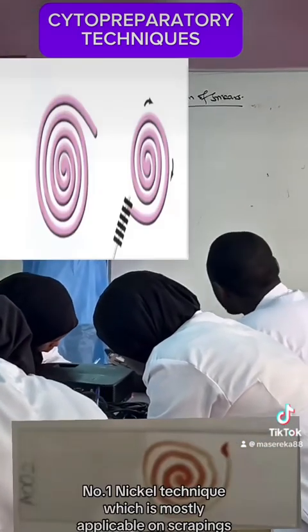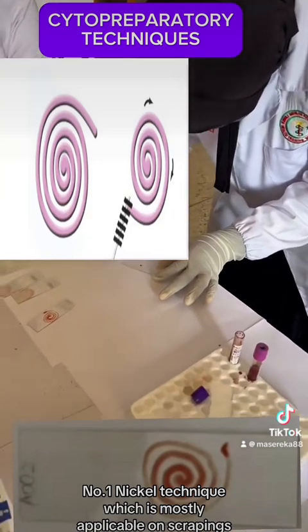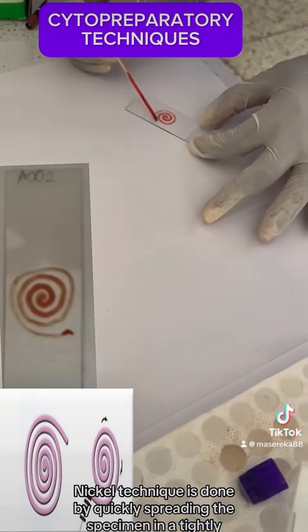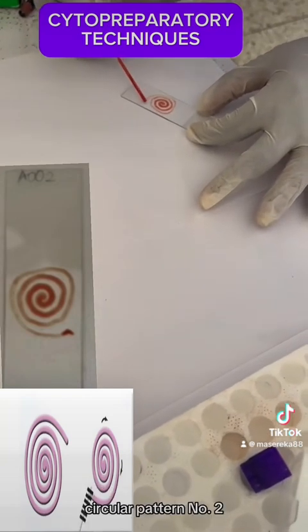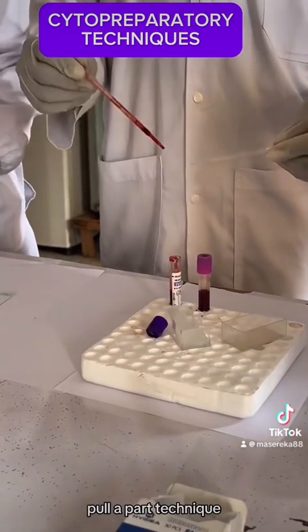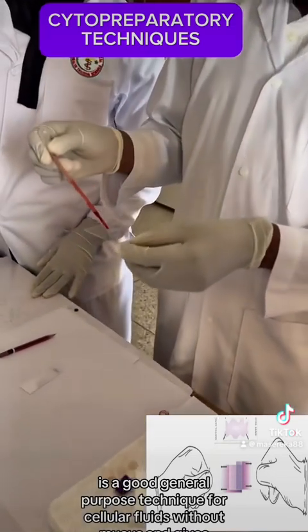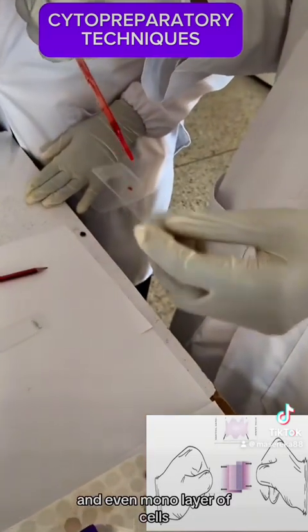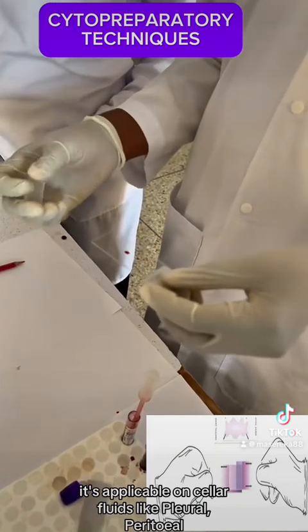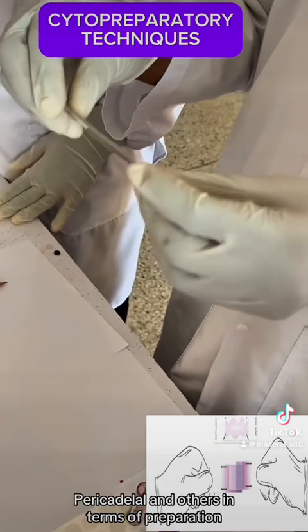Number one, nickel technique, which is mostly applicable on scrapings. The nickel technique is done by quickly spreading the specimen in a tightly circular pattern. Number two, pull apart technique. The pull apart technique is a good general purpose technique for cellular fluids without mucus and gives an even monolayer of cells. It's applicable on cellular fluids like pleural, peritoneal, pericardial, and others.